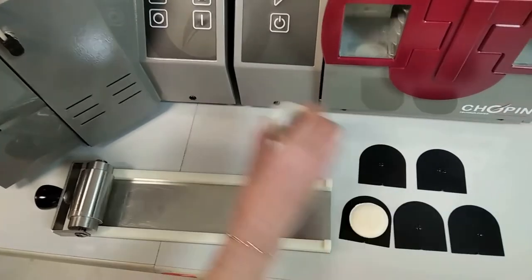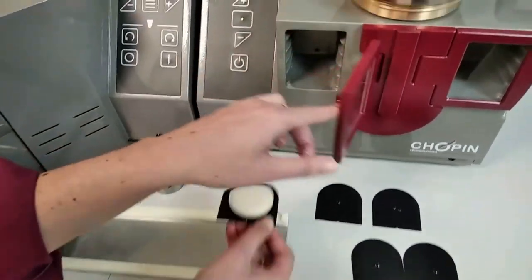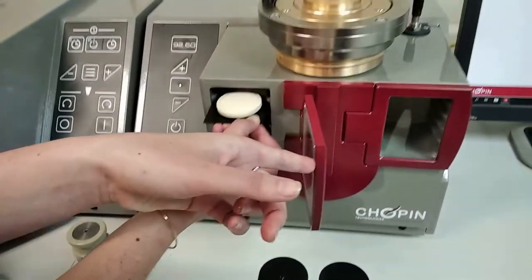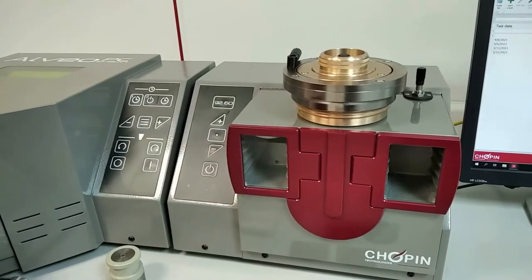Transfer the dough piece to the resting chamber for 20 minutes and repeat this operation with 5 dough pieces in total.